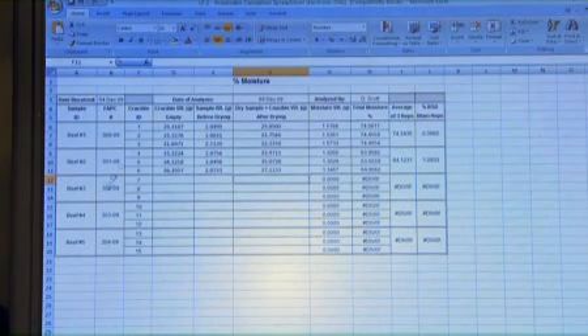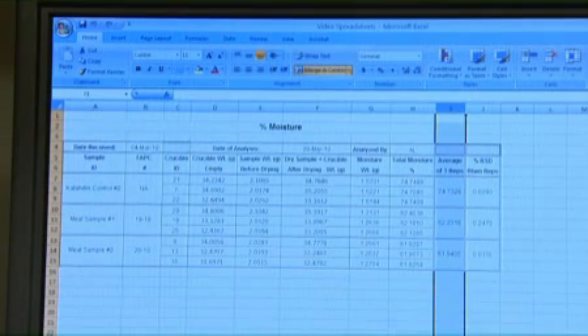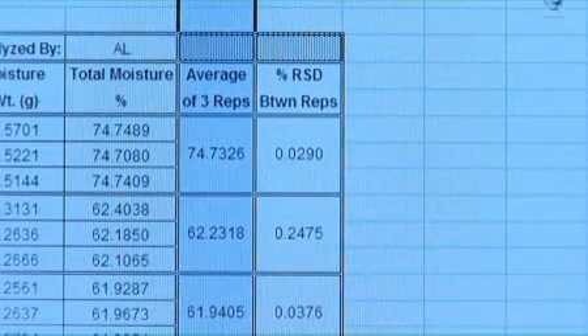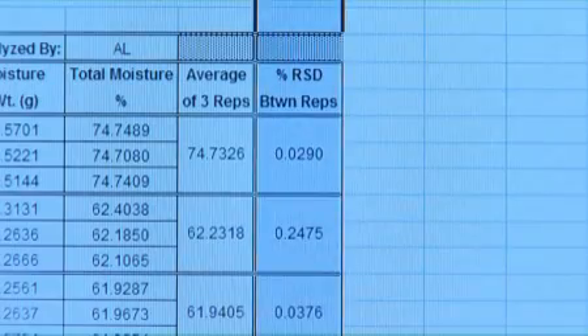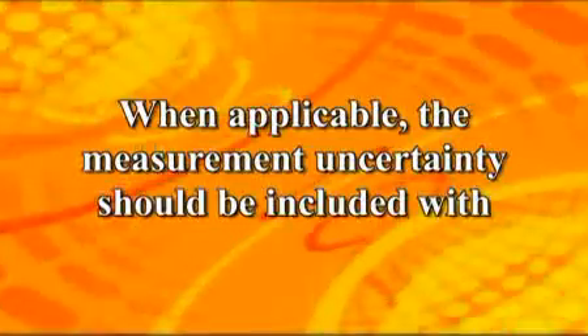Here is an example of what a spreadsheet should look like. The sample IDs, container IDs, and weights can be entered as they are observed. With correct calculation cells set up in advance, the calculation is completely automated as data is entered. Calculate the average of the replicates from the percent moisture results — this will be the reported result. For the statistical analysis of the replicates, calculate the percent relative standard deviation (percent RSD). The percent RSD should not exceed plus or minus 5%. When applicable, the measurement uncertainty should be included with the result.